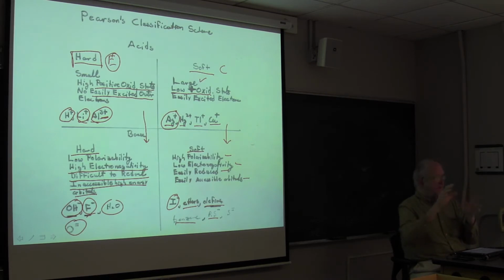So if you want to separate aromatic molecules from aliphatic molecules, you get a silver impregnated phase. It doesn't do a thing for the saturated molecules. It just doesn't retain them much. But it goes after olefins, it goes after aromatics like crazy, and they're much more strongly retained than are the corresponding alkane in the presence of the silver. In the absence of the silver, in GC it's more of a boiling point separation because this interaction is completely missing.